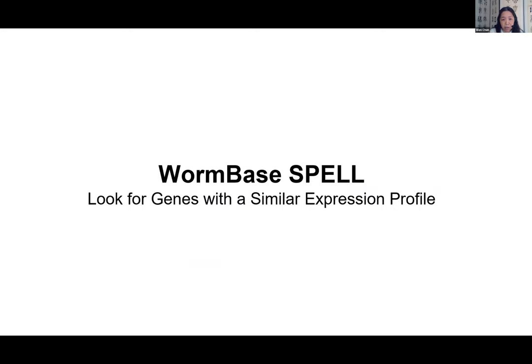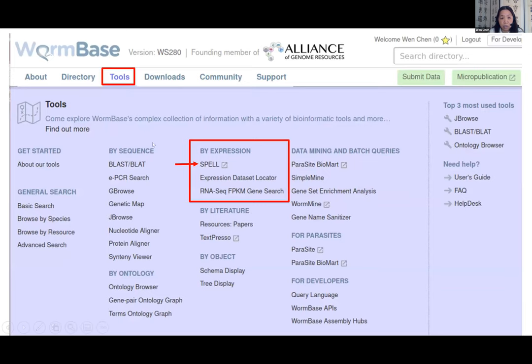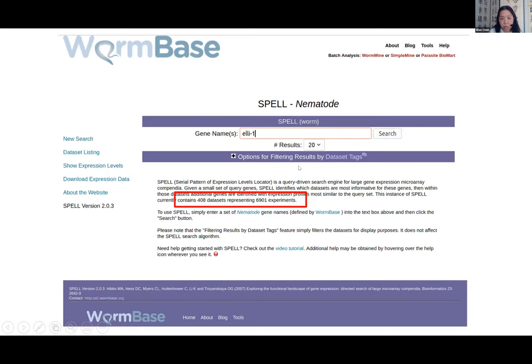Finally, I want to introduce WormBase SPELL — it's not a new tool, but it's very useful because there's nothing like it in the field. SPELL allows you to search for genes that have similar expression profiles to your favorite genes. Under the Tools menu, click SPELL to go to the SPELL website. WormBase has more than 400 datasets representing almost 7,000 experiments — microarray, tiling array, proteomics, or RNA-seq. Enter a gene name, for example elli-1, to find what other genes co-express with it to figure out which pathway it's involved in.